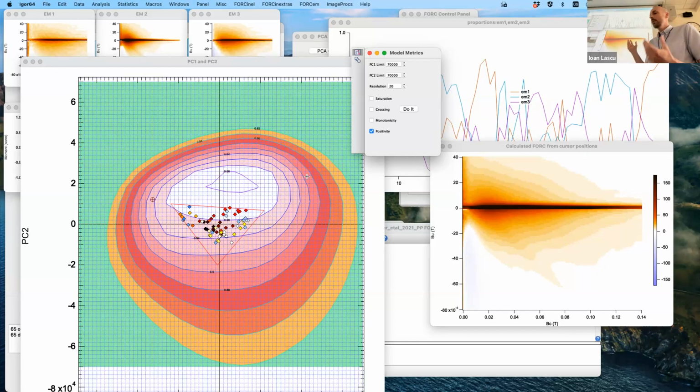You can also do a cutoff and say maybe 99.99. That's arbitrary, right? 0.99 is too low a number, so you have to go to 0.999.